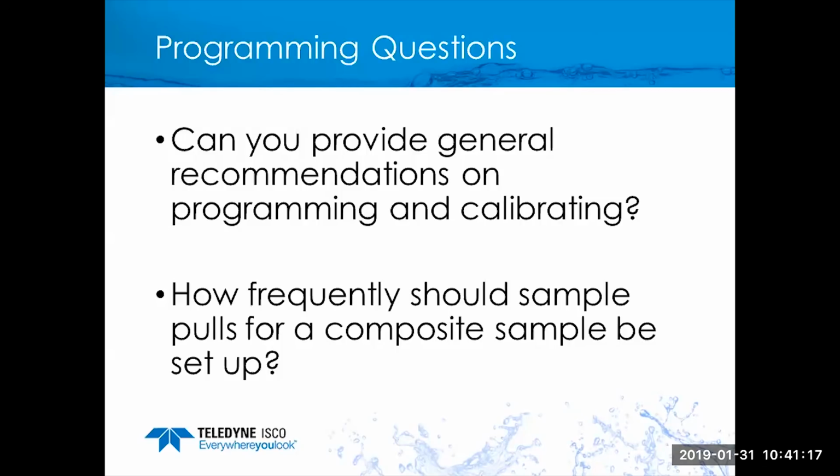You're going to set this program up to typically take flow-based samples over a 24-hour period of time. Therefore, you're going to need to determine at what intervals you want to collect your flow-based samples. And you want to make sure that whatever that configuration setting that you end up putting into the unit is going to be able to cover the full 24-hour period. And at the end of that full 24-hour period, you want to ensure that there's adequate volume in the bottle collected that allows your lab to do the analysis that you're after.